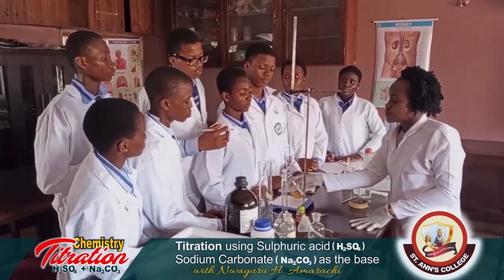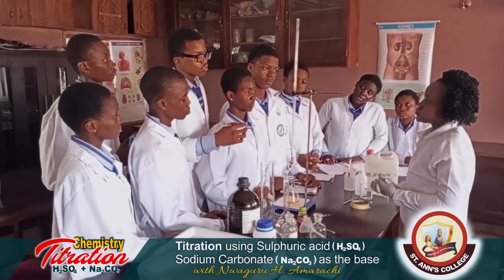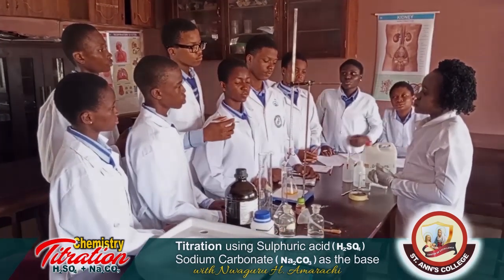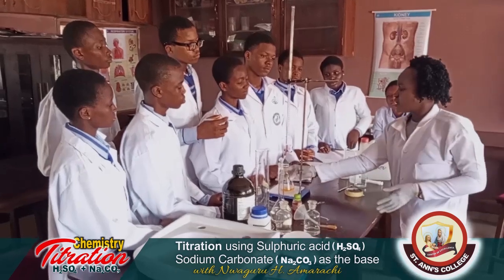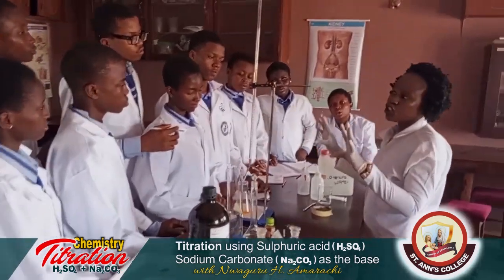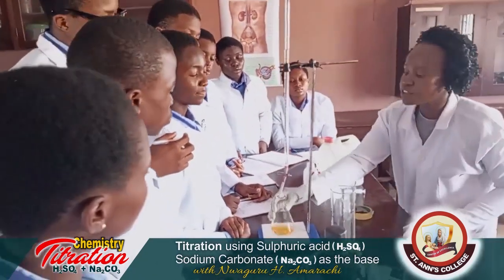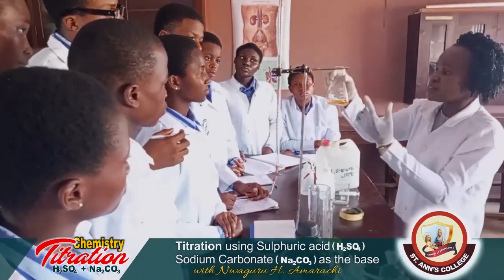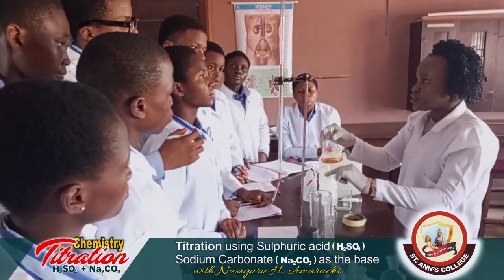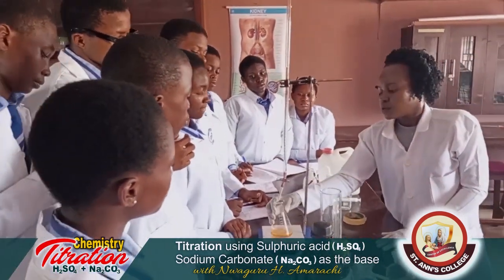Does it mean that the higher the drops of the indicator, the faster the rate of the reaction? It's not faster, mind you. It's an indicator to enable you see a visible color change. That's the essence of it. So one, you have to have a clear view of the indicator first, so when there is a color change from your titration, you also view it clearly.